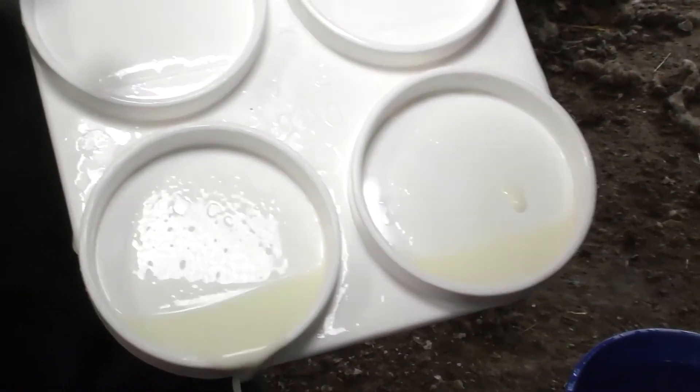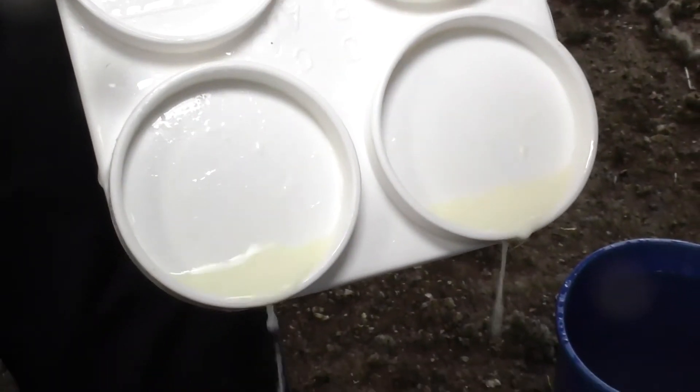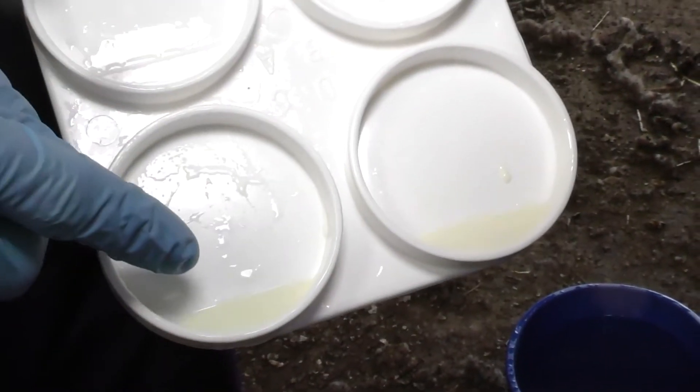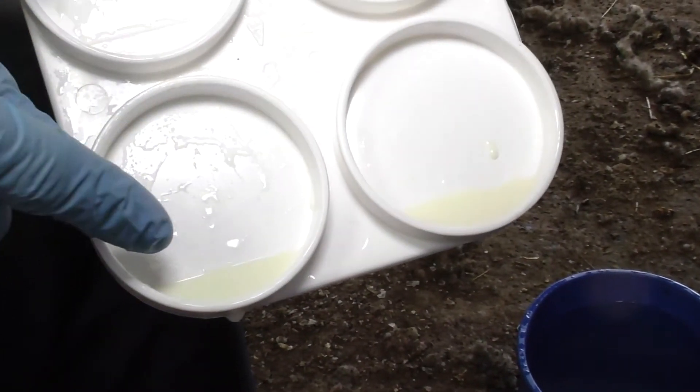So we have about three mils left in the bottom of the well. When the milk reaches this line here you know that there's three mils left.